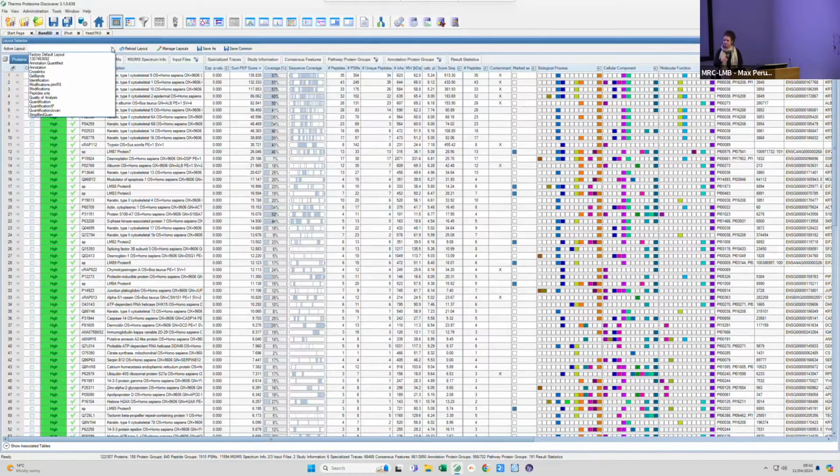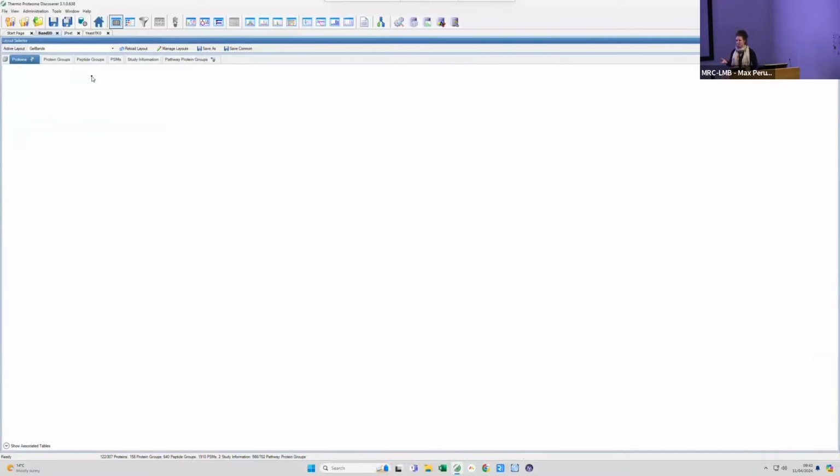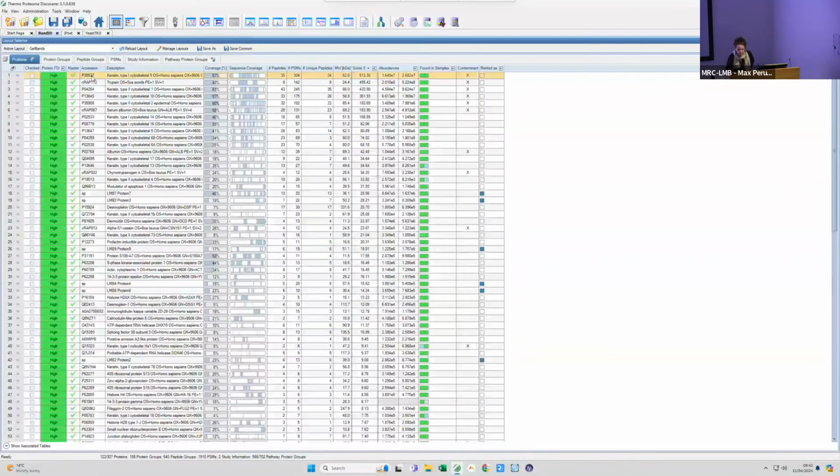You can create one, save it, and then next time around, you just open a project, click on the layouts, and then you go. I'm going to use the band analysis, one that I created a very long time ago. Once you click on this new layout, it will filter off the information that's not necessary for this kind of analysis.